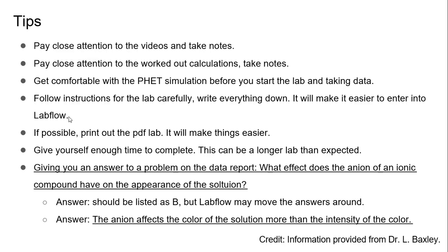And take data. Follow the instructions very carefully. I suggest you write everything down, everything. Because if you don't, you're going to have to go back and do the simulations again. If possible, print out this PDF lab so you can write all the information exactly where it needs to go on this lab. It'll really make things a lot easier for you. Give yourself enough time to complete. This is a little bit long, and you don't want to keep having to go back on things that you forgot or missed.